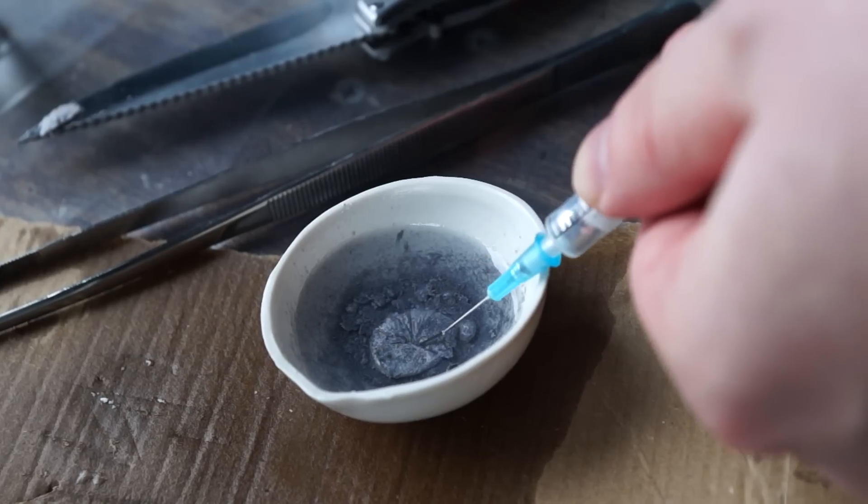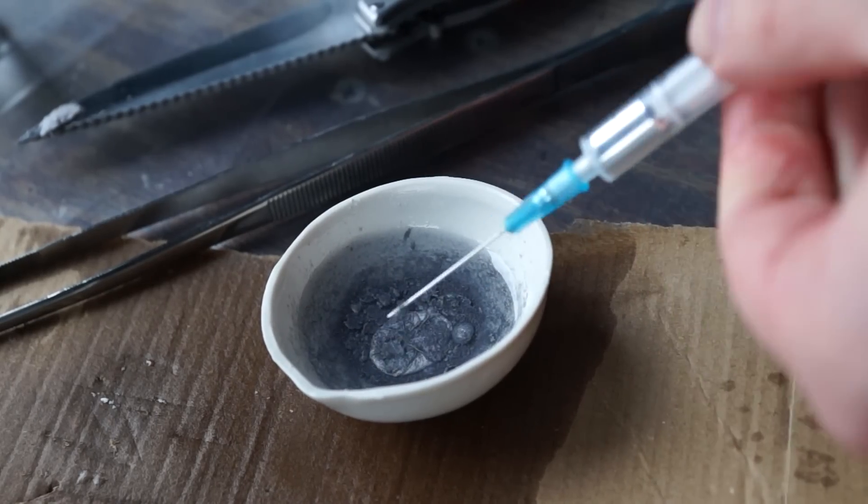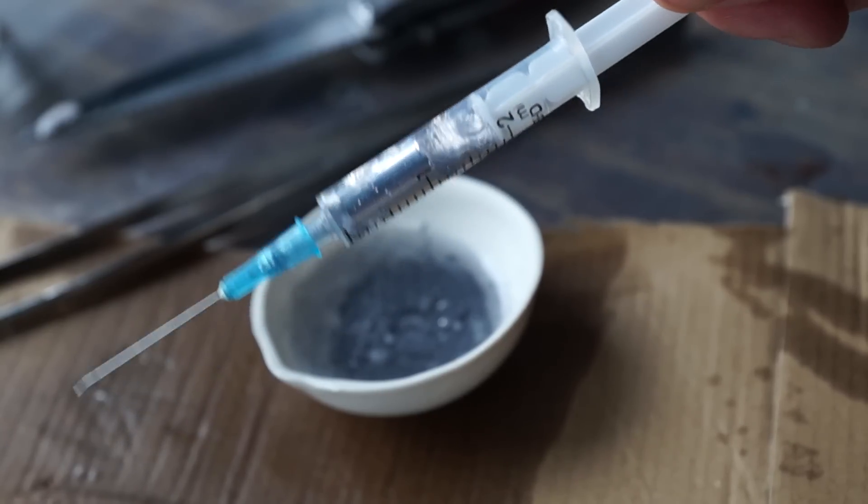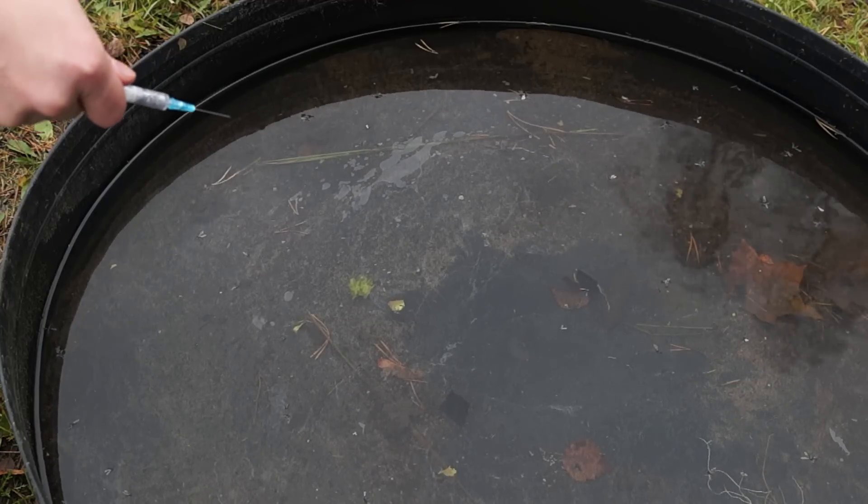I'm filling the syringe with a little bit of alloy. The alloy has a glossy surface inside the syringe, much like mercury. Now I'm draping the sodium-potassium alloy into the water.